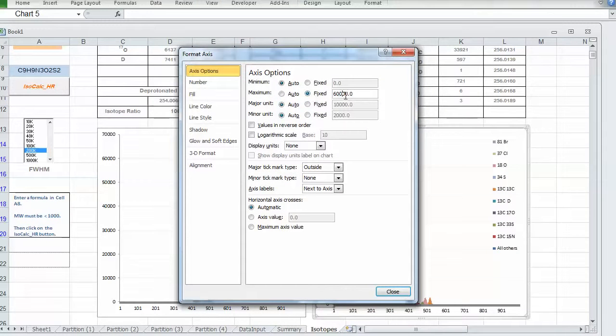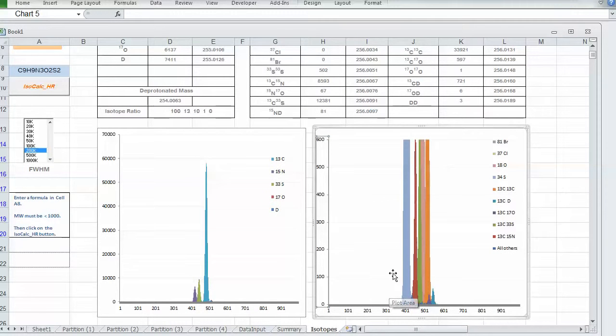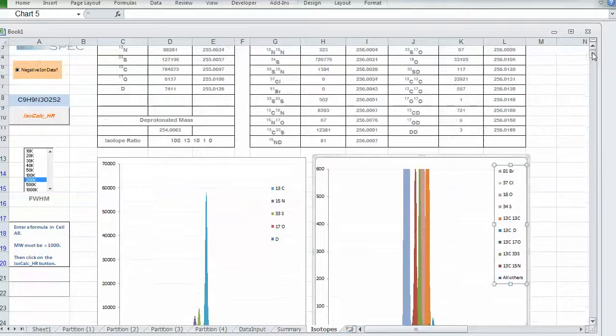If we take 2 zeros out, make it 100 times bigger, now we can see the molecules with 1 C13 and 1 nitrogen 15 are the red piece in here, and we can get the exact location of those from the table above.